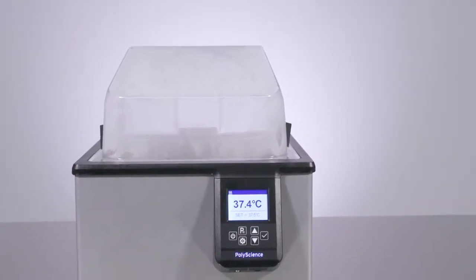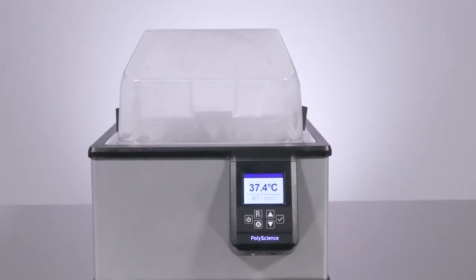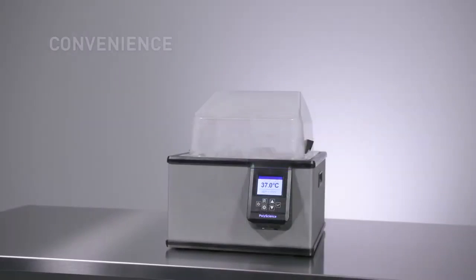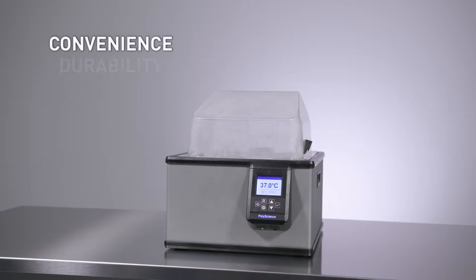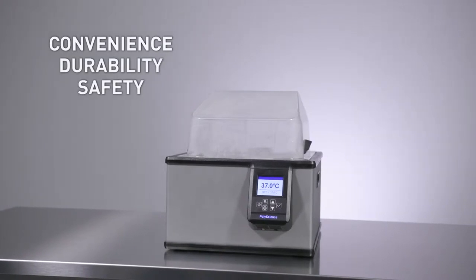PolyScience believes you can have both as well as convenience, durability, and safety.